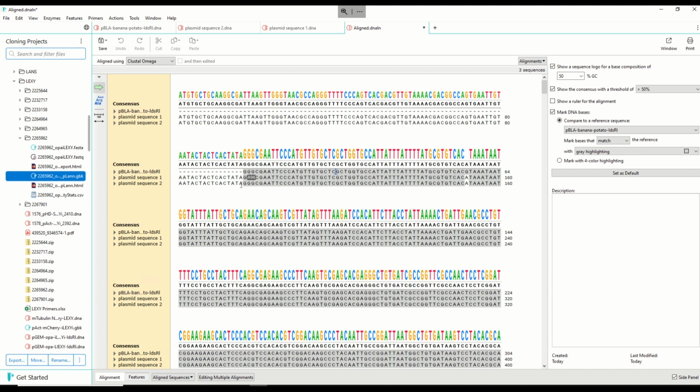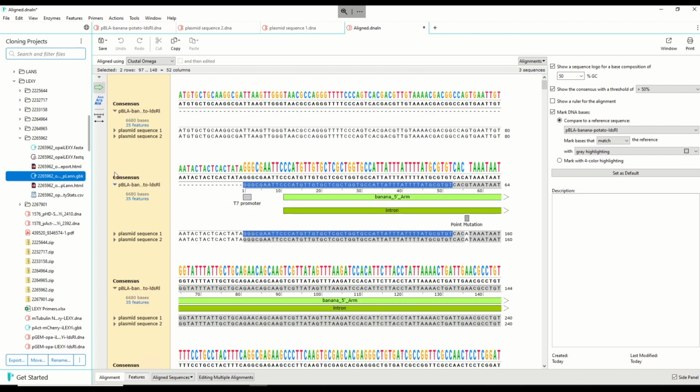Because that's not defined by you, it's defined by the sequencing facility. They don't know what 0 should be. And SnapGene doesn't shift the circular plasmids to align them for some reason, right? So because this was 0 on your template, that's where it's going to start.